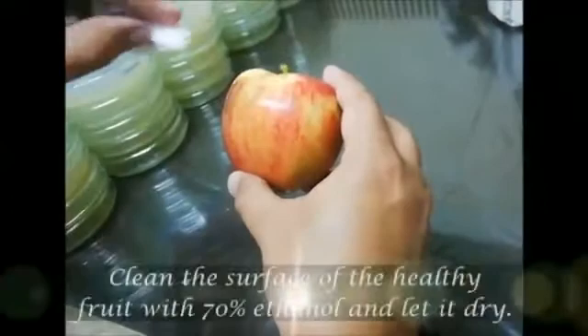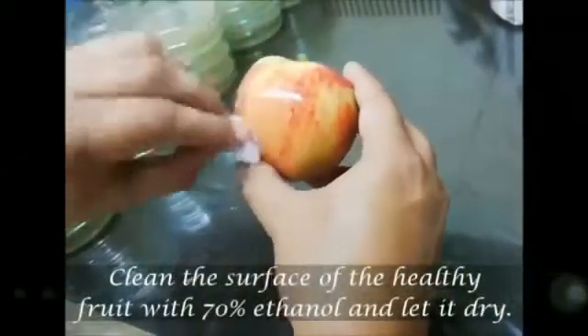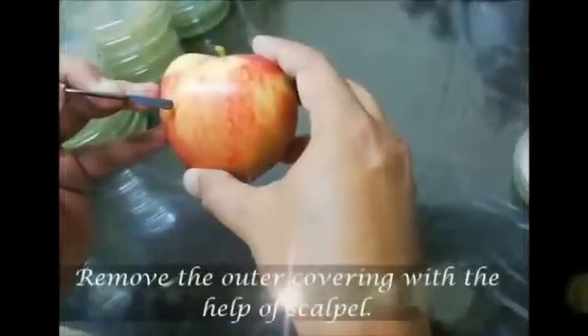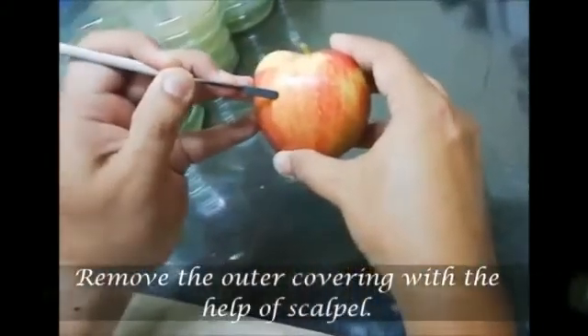First of all, clean the surface of the healthy fruit with 70% ethanol and let it dry. Remove the outer covering with the help of a scalpel.